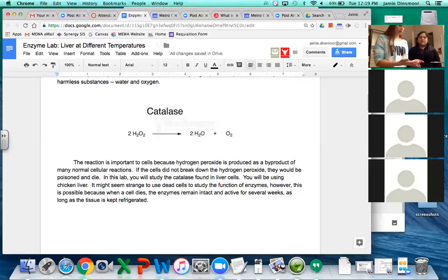Okay, so we have two waters here. We have ice cold water and we have room temperature water. Okay, so we're getting our waters set up here. We have our ice cold water, which we're measuring in Celsius, so it should go down to 0. It should be close to 0 degrees Celsius. We also have room temperature water. The temperature of the room looks like it's somewhere around 18 degrees Celsius, which is approximately normal. You guys are gonna be in charge of the hot and body temp waters with the thermometers.